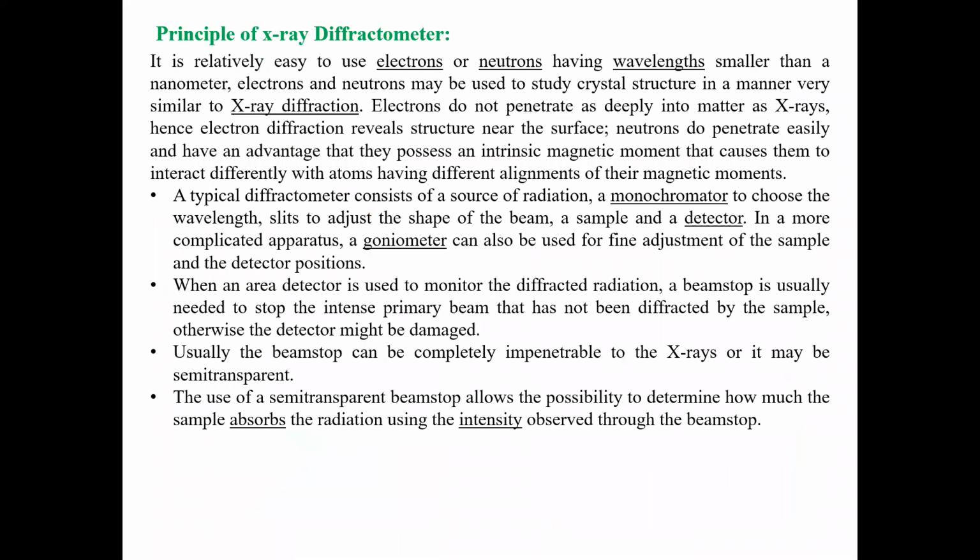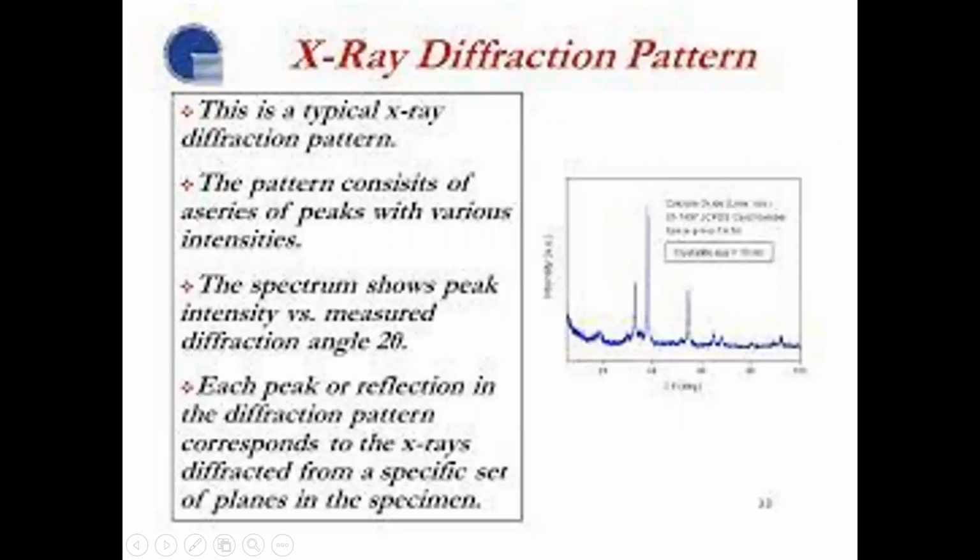Okay, so this is all about the X-ray diffractions. From these X-ray diffractions, we get the informations about the size of nanomaterials, the morphology, and what kind of intensity your samples have, or the radiation absorbed. So that is the information which will be given by the X-ray diffraction patterns.